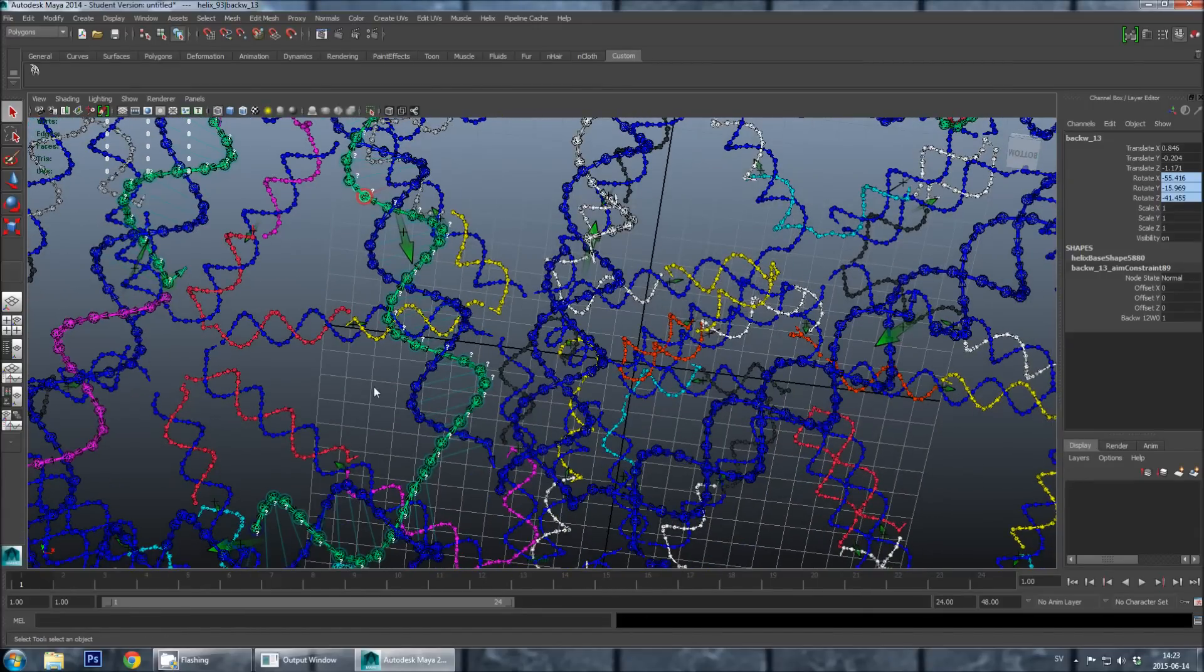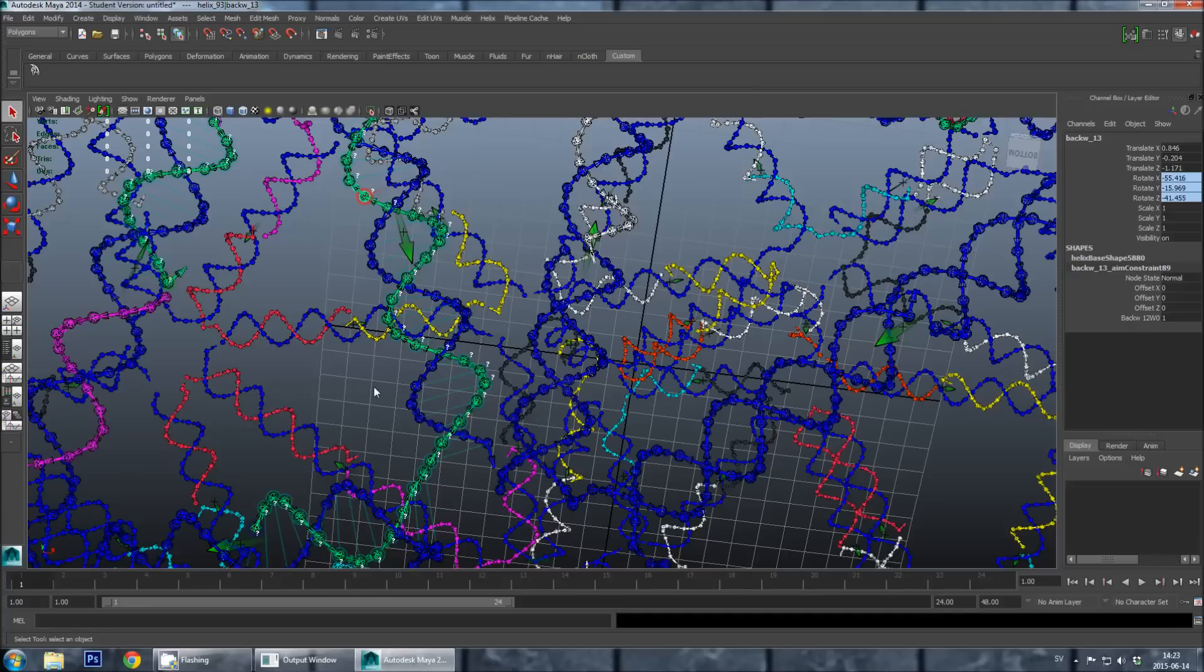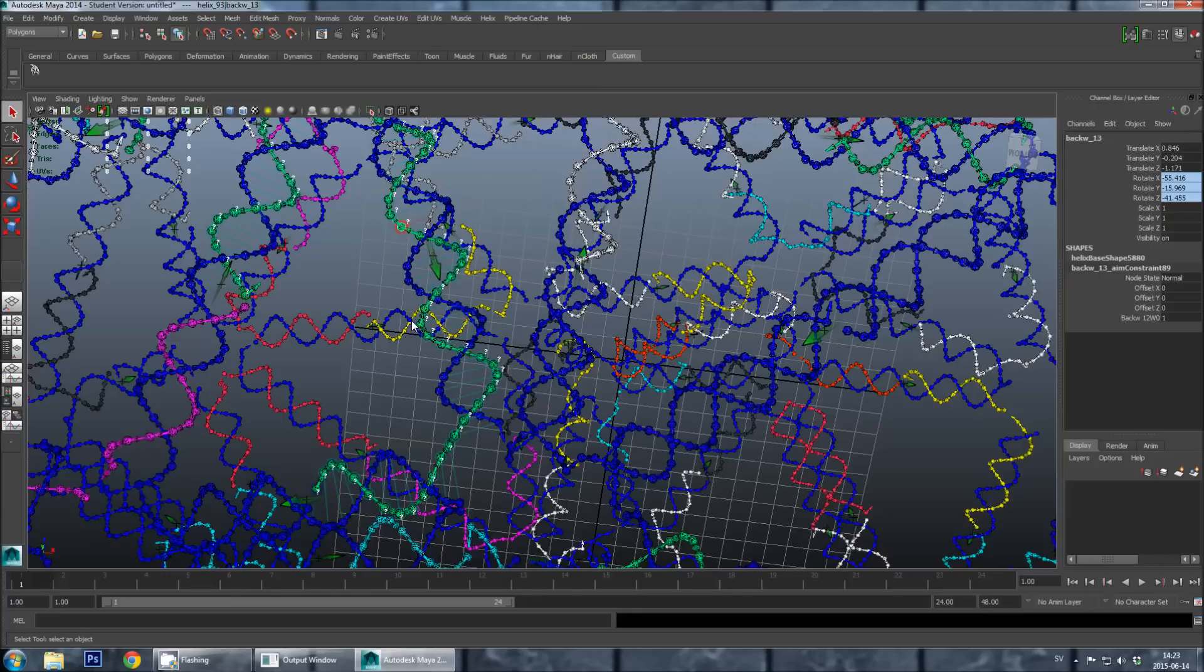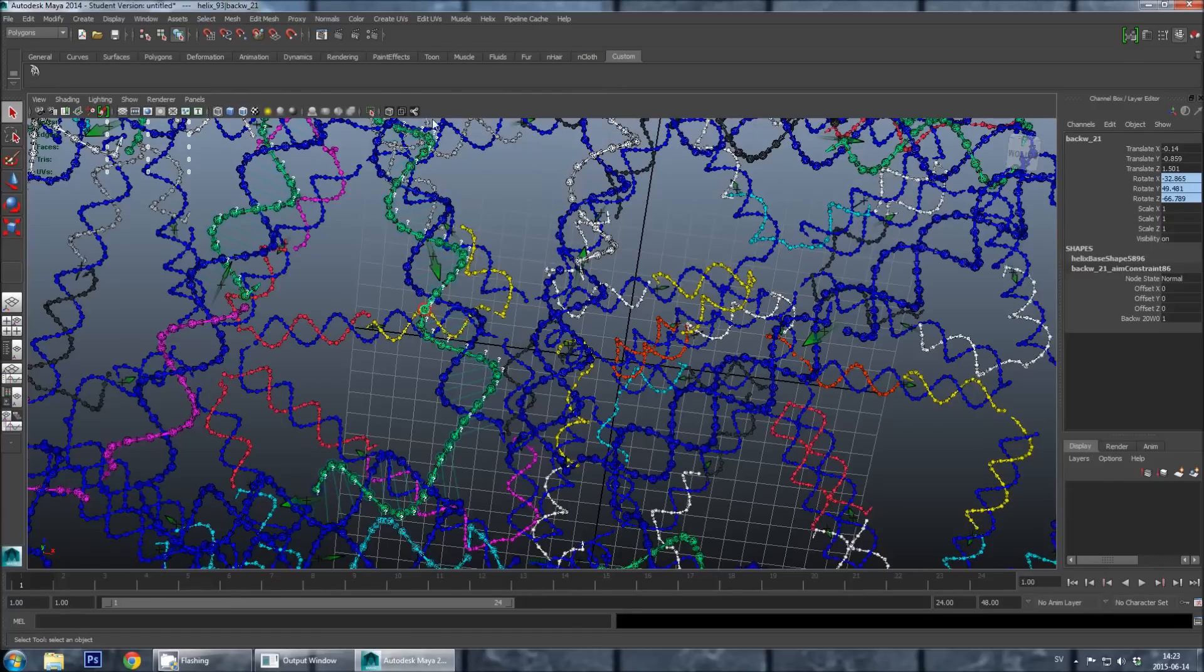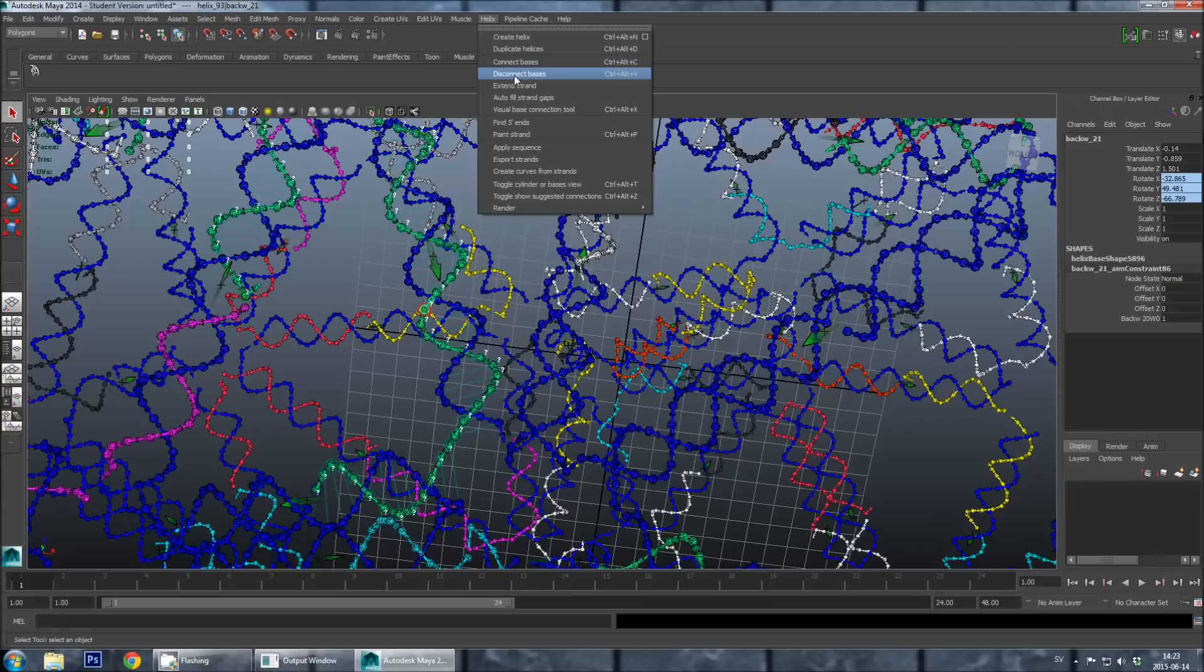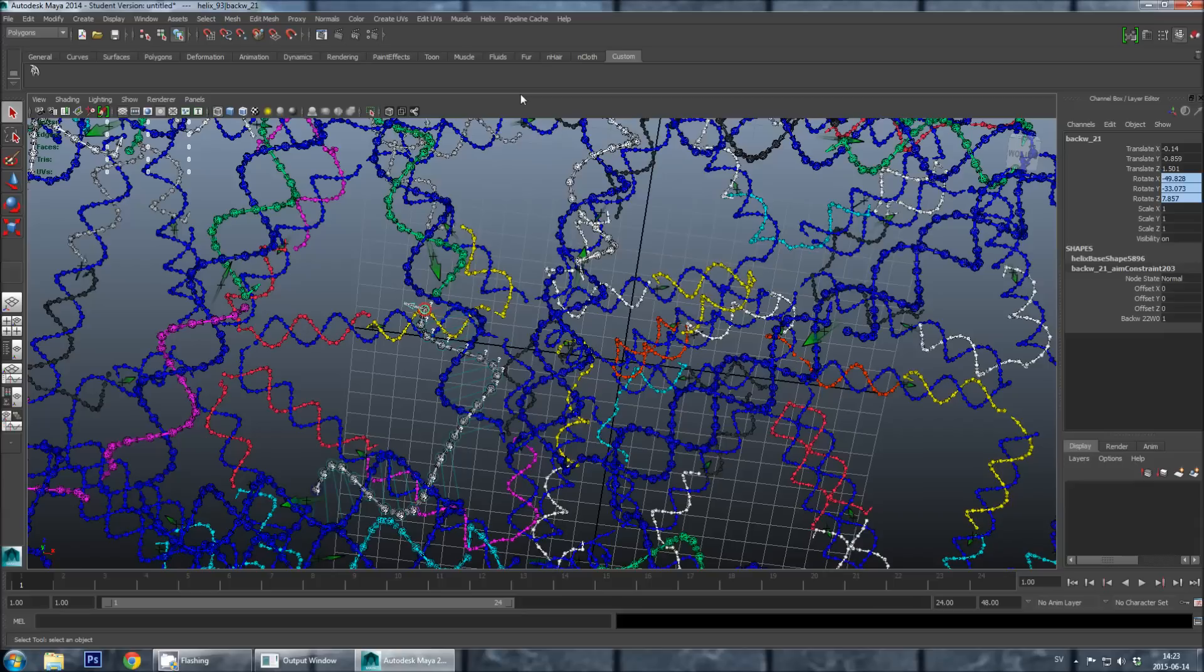So let's say that we just wanted to move the breakpoint between these two staples. Then the way to do this is to first join them as we just did, and then again cutting them up, by selecting one of the bases on the new long staple, going into helix, and disconnect bases. So connect bases and disconnect bases is the two features that you use to add, remove, or move staple breakpoints in the design.